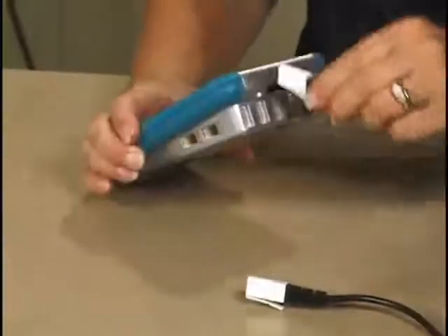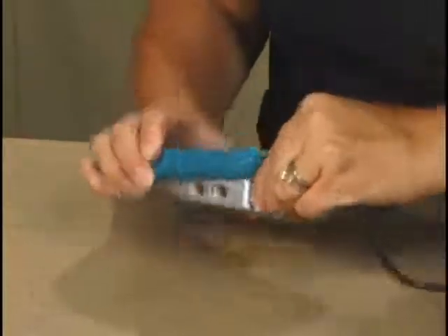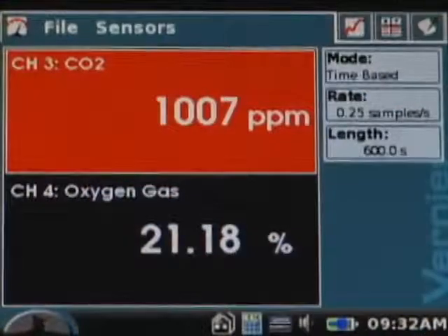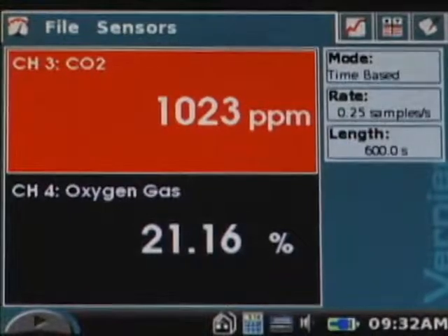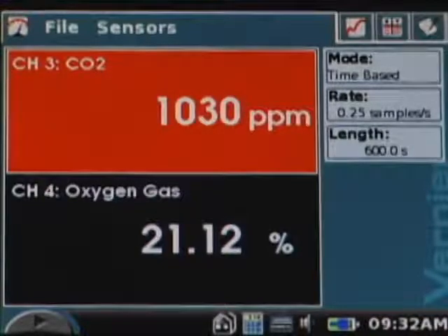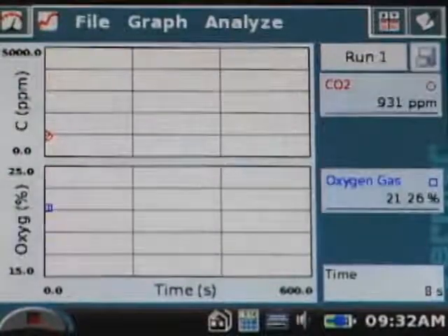Connect the sensors to any of the 4 ports on the top of LabQuest. The software auto-identifies the sensors and sets up data collection parameters that are perfect for this experiment. The CO2 gas sensor has a 90-second warm-up period. After 90 seconds, watch the CO2 readings to see that they've started to increase and start data collection.